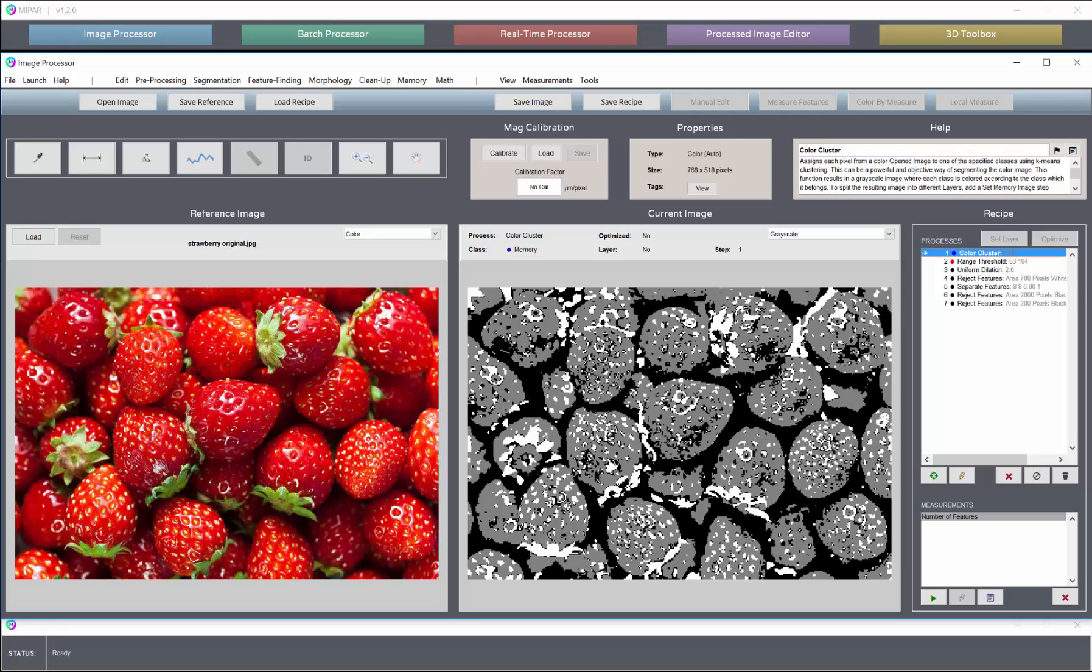So that's it for the color cluster demo. We've had two examples, a two-class and a three-class where you've really only been interested in one. I hope you've found the tutorial useful and that you make use of this in your research and work.